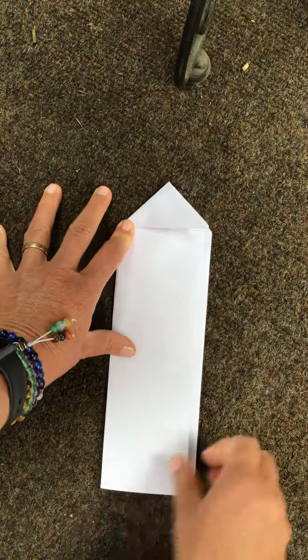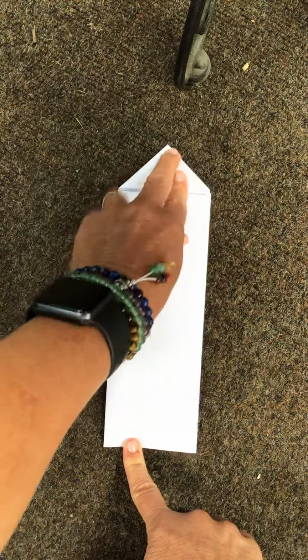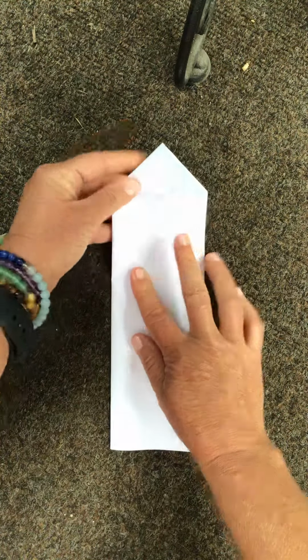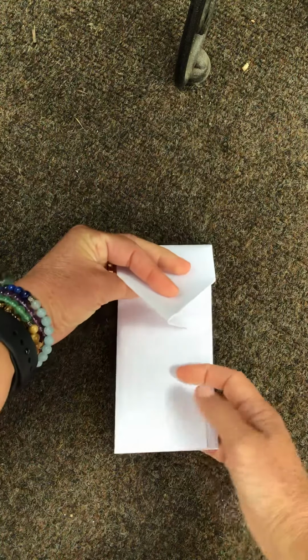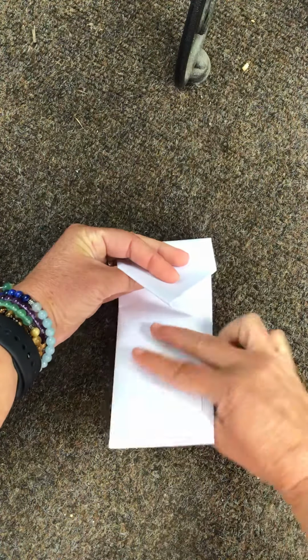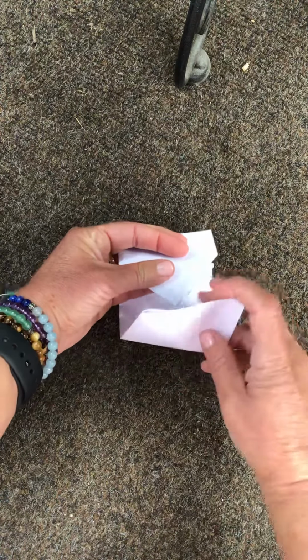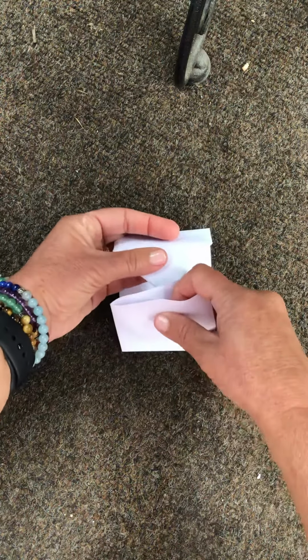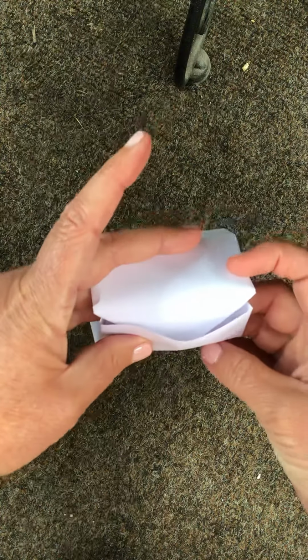Now the only thing we have to do is seal off the bottom. So this is the tricky part. You're going to take this triangle at the top, this tab, and you're going to bring it up and over, and you're going to stuff it into the opening that you see here at the bottom. So you're going to bring that opening and the tab, and open it kind of up like this, and the tab together. Put the tab inside that opening. I don't know how well you can see that I'm doing that there.